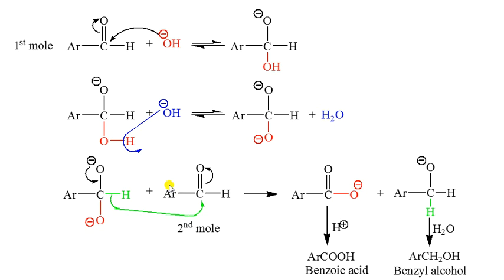Decreasing the hydrogen atom means this is under oxidation, it is the reducing agent. This is increasing the hydrogen atom, so this is under reduction, this is the oxidizing agent. And of course both of them will convert to benzoate and benzyl alcohol.